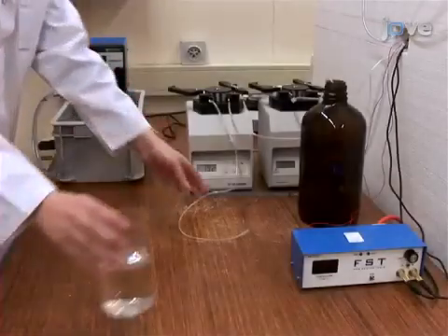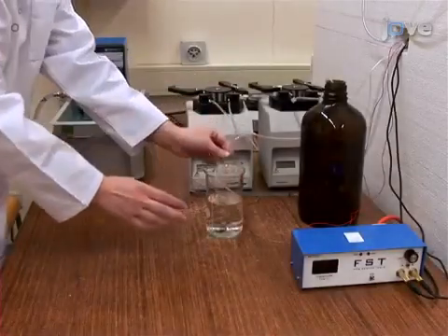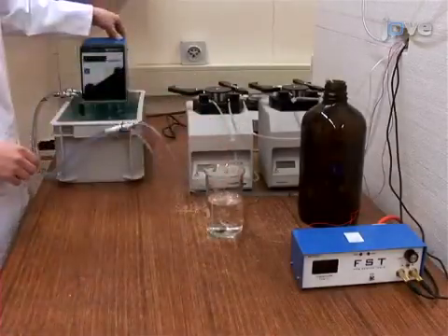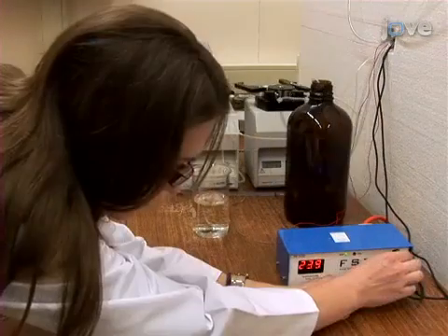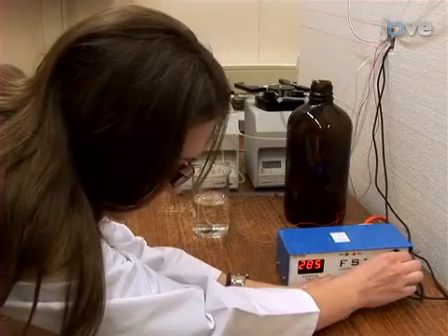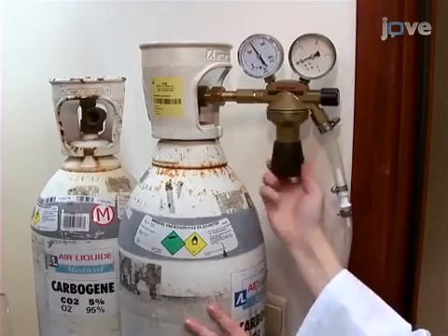Begin this procedure by rinsing the perfusion circuit with distilled water for a minimum of 20 minutes. Then, turn on the heating systems. Start the carbogen bubbling in the circuit.